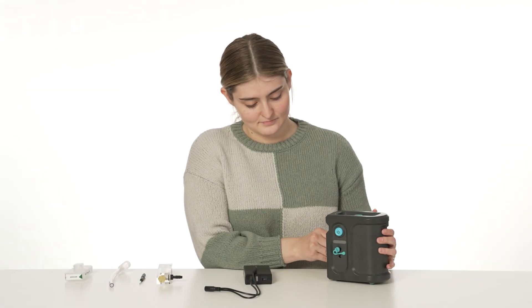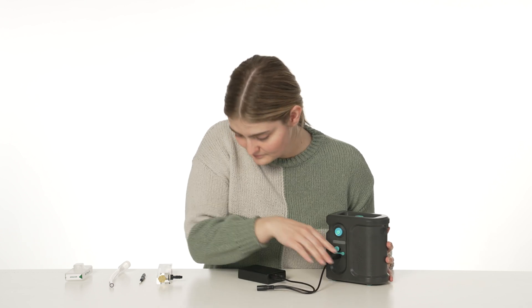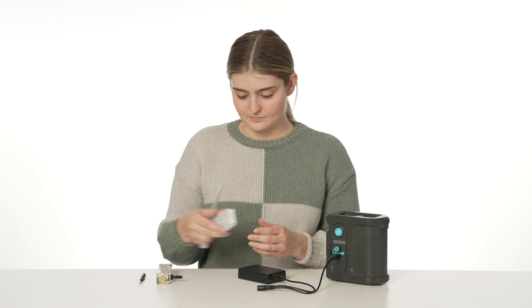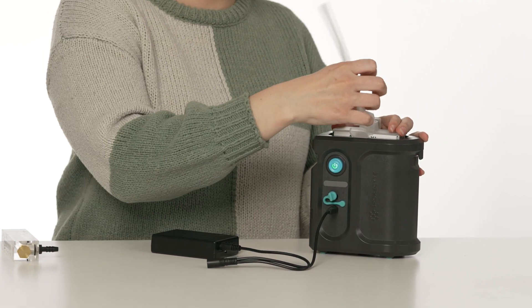Now we can proceed with calibration. To set up the calibration equipment provided, first connect the pump to a power source and attach the cassette to the pump. Next, attach the adapter with the correct connection mount to the cassette.